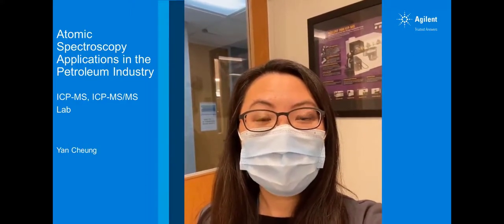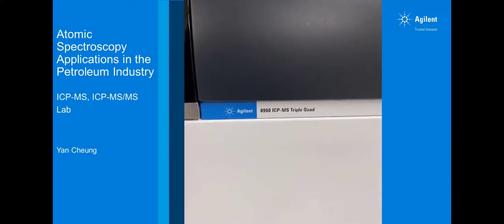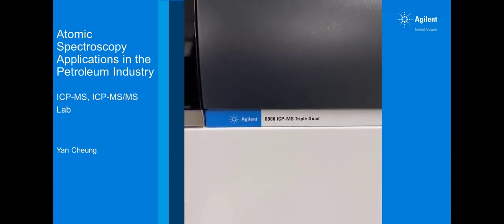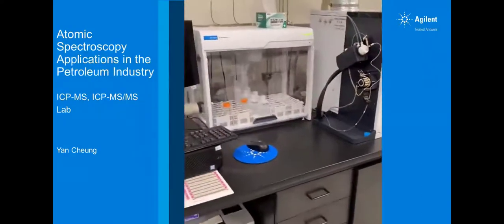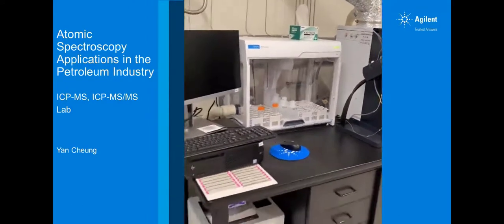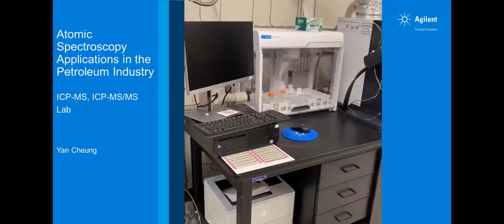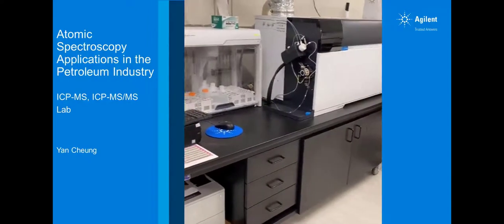Hi, welcome to the ICP-MS lab in the Chicago area, one of our center of excellence. Now let me give you a mini quick lab tour. Over here we have an 8900 ICP-MS triple quad instrument, along with an SPS 4 autosampler, with a computer and printer. They all fit on this very nice lab bench.